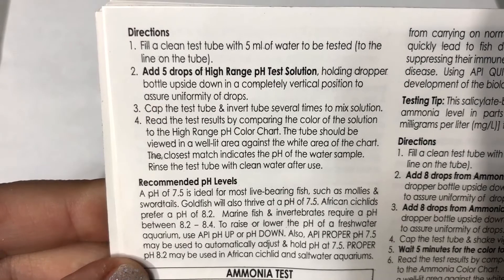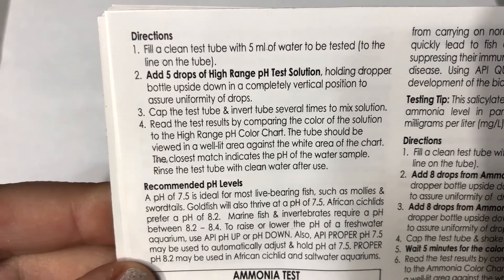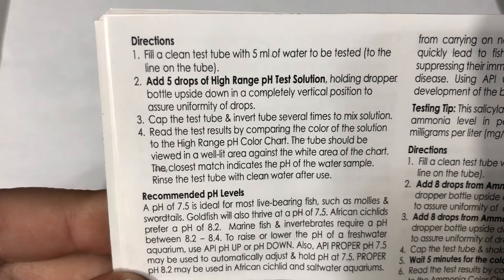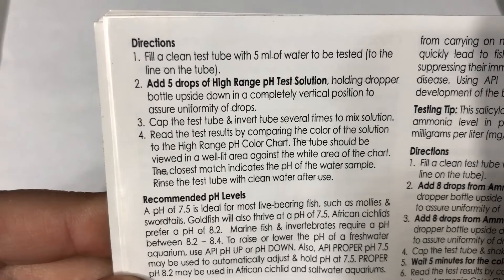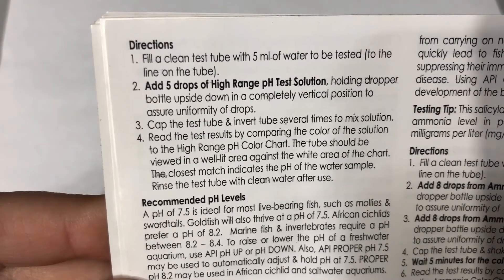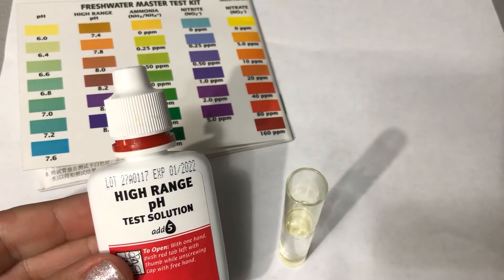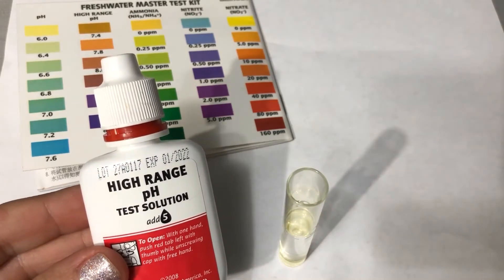Here are the directions for our high range pH test. You need to use either the low range or the high range — I know my water needs the high range test. We're going to fill our tube with five milliliters of water, add five drops of the high range pH test solution, cap the tube, invert it several times to mix, and then read the results by comparing it to the color chart. I have my color chart and my high range pH test solution ready.